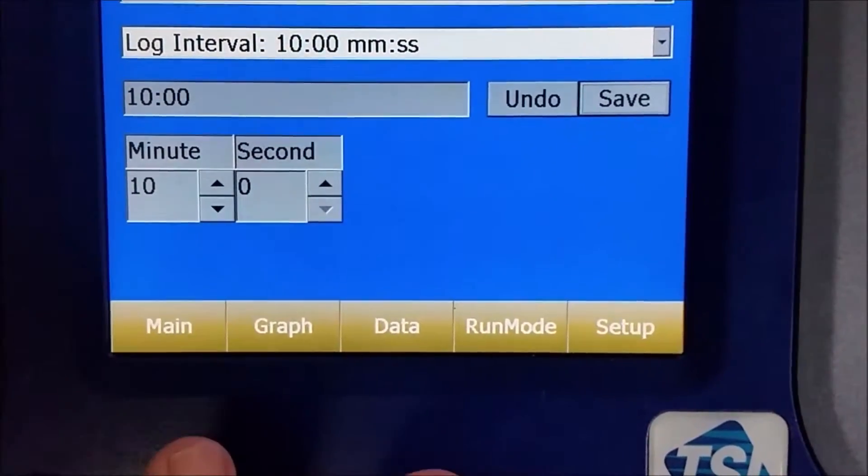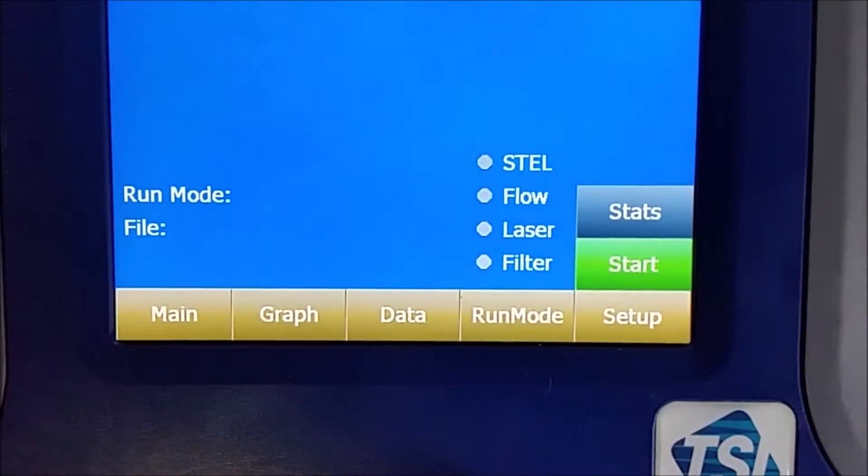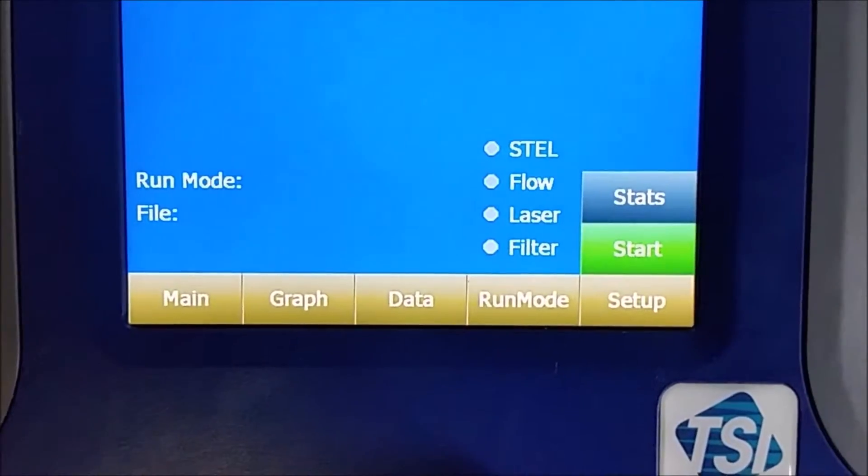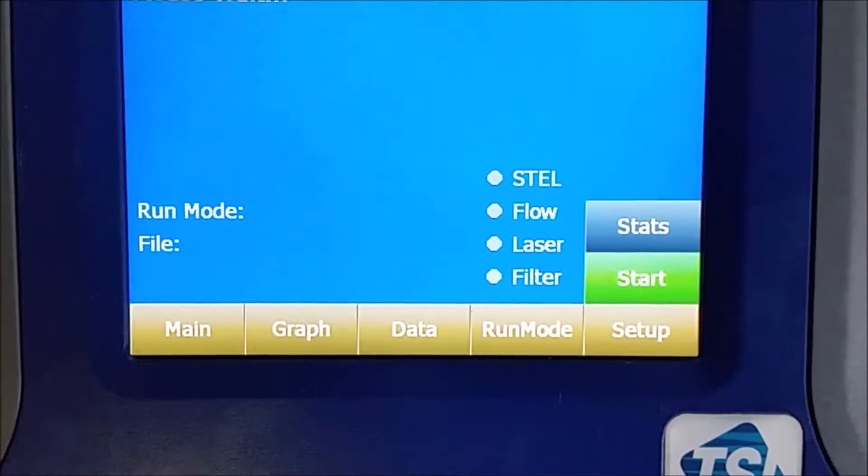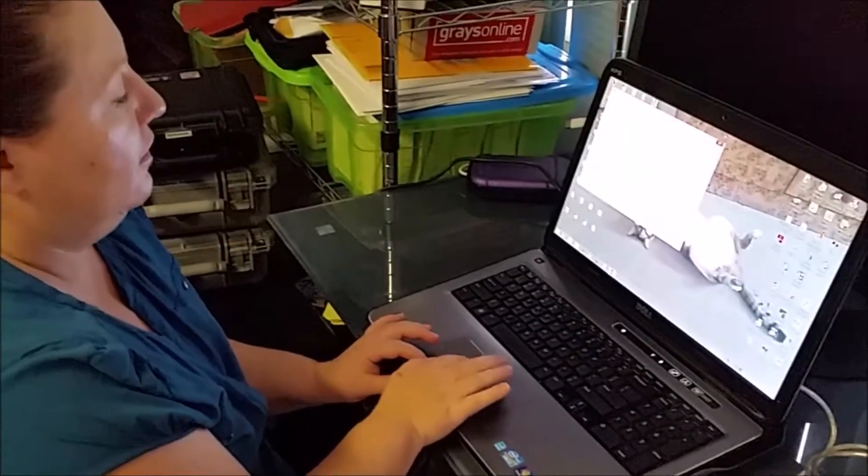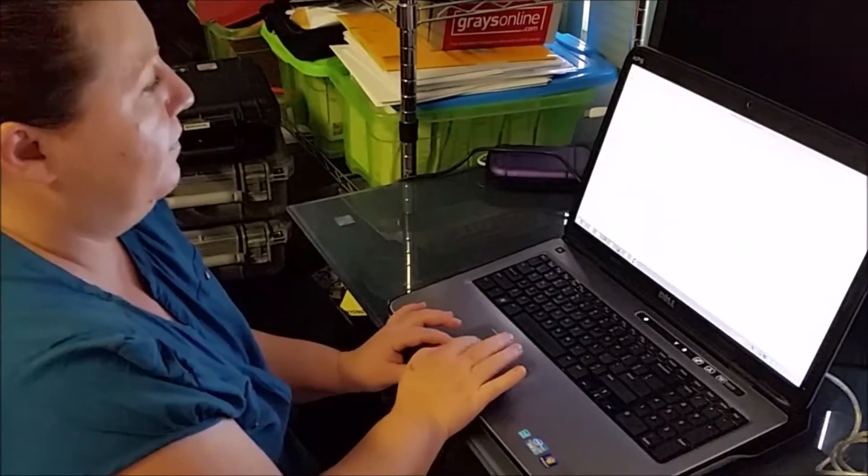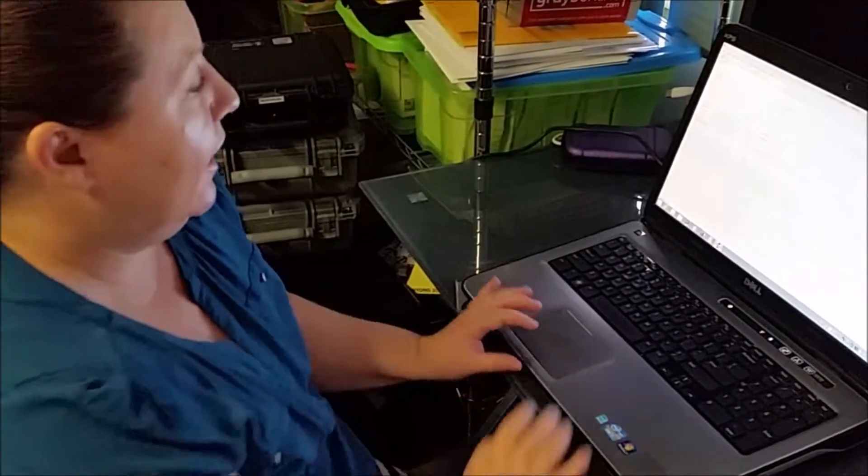So, how do we actually download the data? For this, we have to go into the actual program, the TSI DustTrak program, which is called TrakPro.